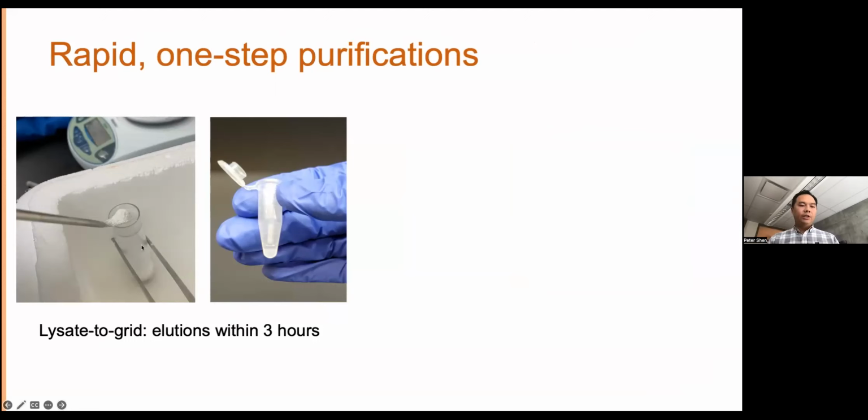And the general procedure is you take this ground up lysate, this powder, and with typical lysate clarification steps with resin binding, washing, and then finally eluting our sample, we have something that's hopefully ready for EM. And the goal of our IP procedures is to have something within 3 hours of thawing the lysate.